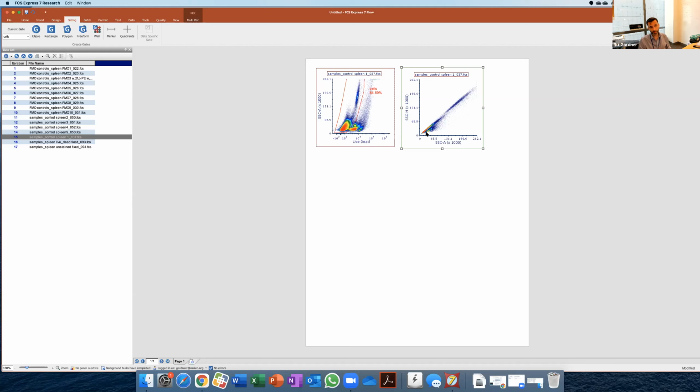We actually have here an activation marker. Be aware that sometimes when cells are activated, for instance, B cells or T cells, they actually increase in size. And so they will show up somewhat in the doublet side. However, they usually also follow the diagonal, right? So in principle, these will be doublets, but we can try and see later on if this matches, based on all the other samples also, to be able to really exclude them or not.